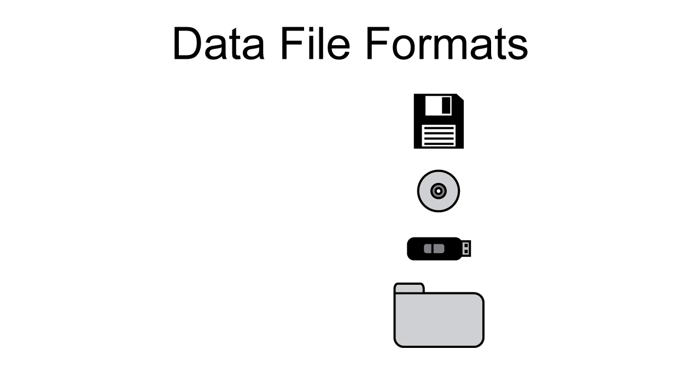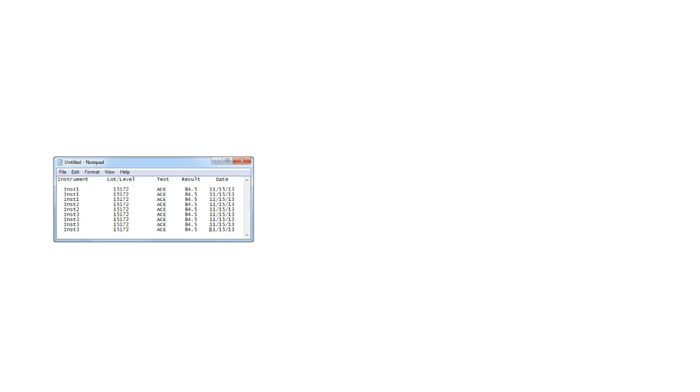At this point, you might be wondering what a data file should contain. A QC data file should contain data for all instruments, controls, levels, and tests.